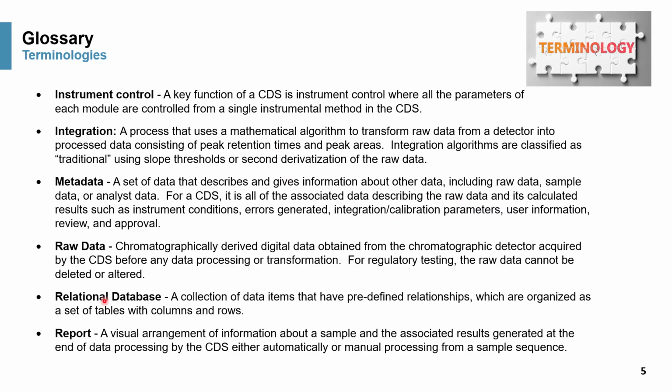This raw data, which are derived from the chromatographic instrument from the detector output with a time axis, and these are transformed through the integration process into a peak table, eventually to a report. Most CDS use a relational database, which we will comment further.